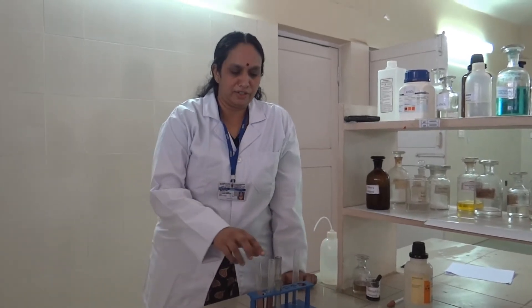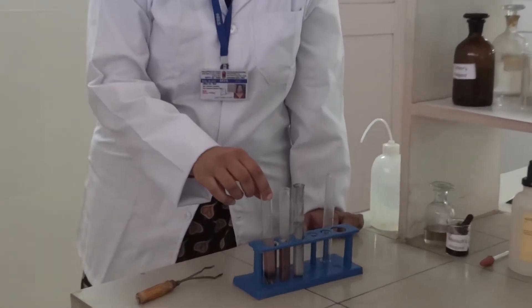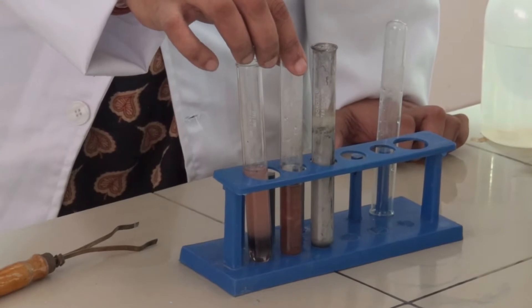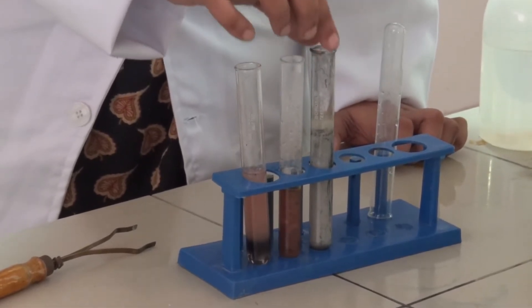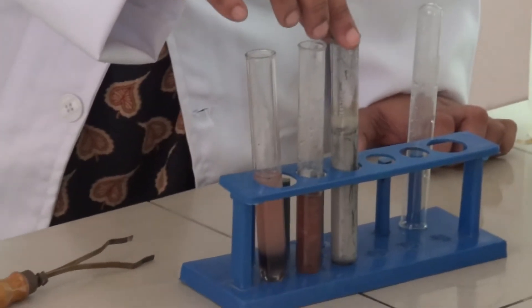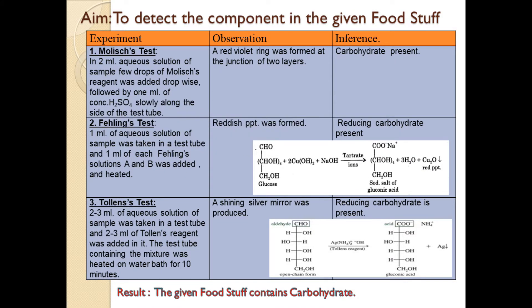As we can see, all three confirmatory tests are quite visible. The first was the Molisch test — the ring proves the presence of carbohydrate. The Fehling's reagent has been reduced to the reddish brown precipitate. And this is the silver mirror test which confirms the presence of a reducing carbohydrate. Now record these three experiments, their observations and inference in your practical record. Don't forget to write the aim, the experiment, observation, inference and the result.